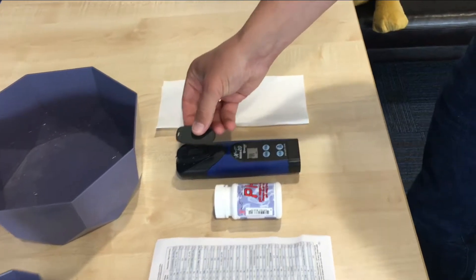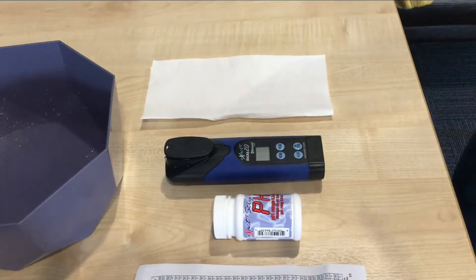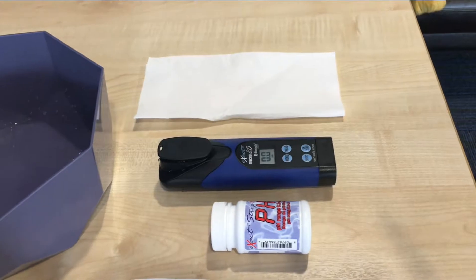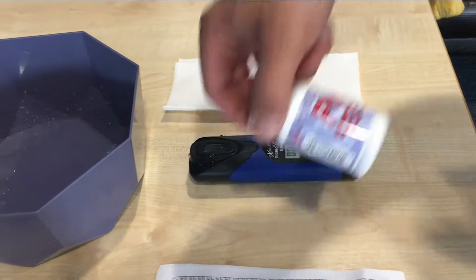We put the cap over, and then we press zero. This is the basic instruction — not using the app, just to get the test done. We see 0.00, so we're ready to start the test.